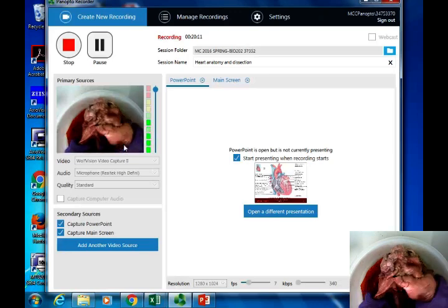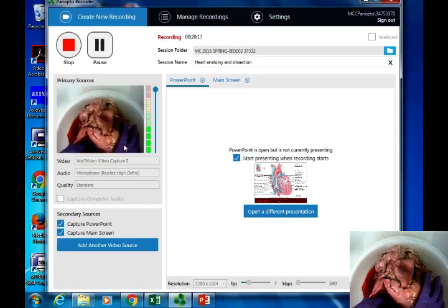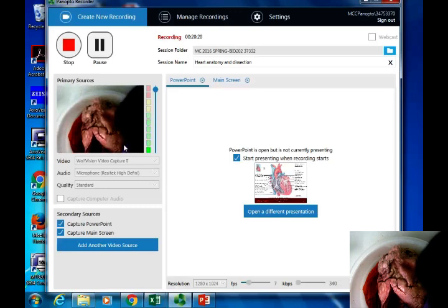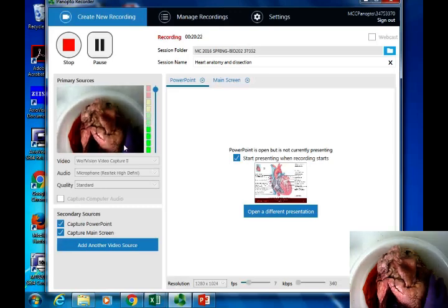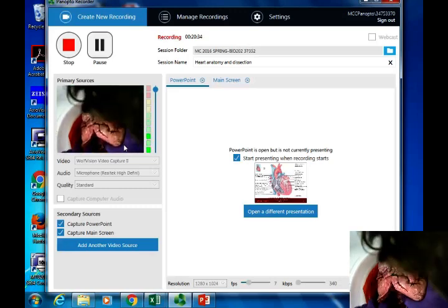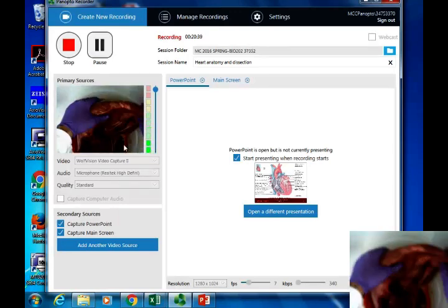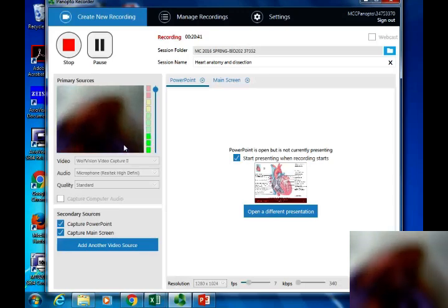There are some, like for instance, even here, this is going to be some. There should be a bigger one as well, like in the sheet, you tend to find it. So oftentimes in the other ones that we see, the moderator band is much thicker, even with the smaller heart. So this one seems a little bit smaller. There may be additional parts to it that I don't see. The rest of these are chordae tendineae. Oh yeah, sure. There. So all of these, you can see how these are dense regular connective tissue.